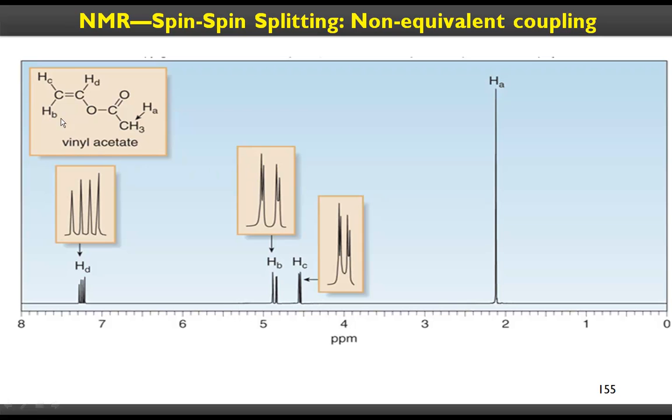Okay, and so this proton in turn has two different neighbors. This is not chemically and magnetically equivalent to this one. So this is different from this one because the local field that this experiences is different from the local effects that this experiences. Anything that has a different chemical environment and different magnetic environment would be different on the NMR spectrum. So this would be further split by C in two ways, and this has another neighbor, so that doublet would be split further in two ways. If you zoom in, you will get this kind of thing, although it looks like a doublet here.